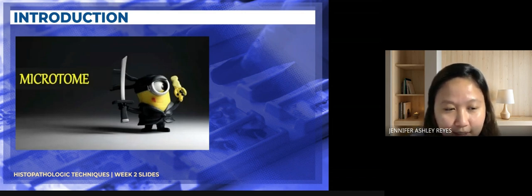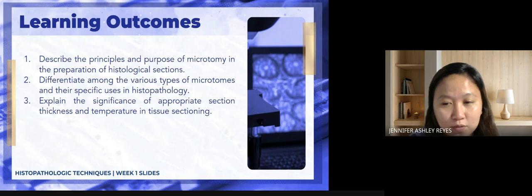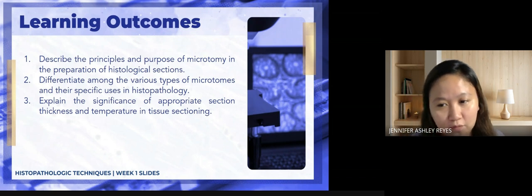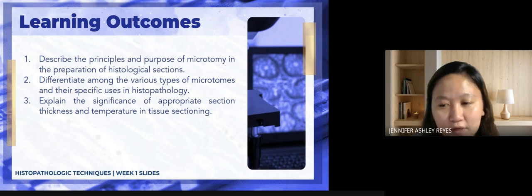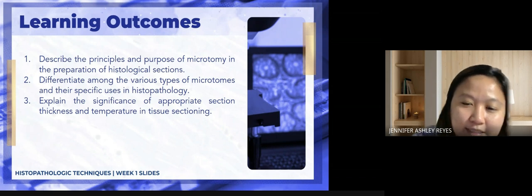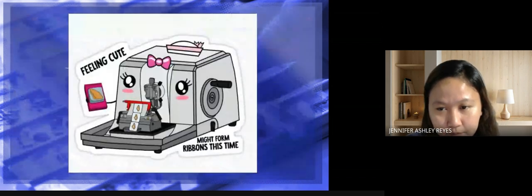So, what is a microtome? For this lecture, we aim that you are able to describe the principles and purpose of microtomy and the different types, and explain the significance of appropriate section thickness and temperature in tissue sectioning.